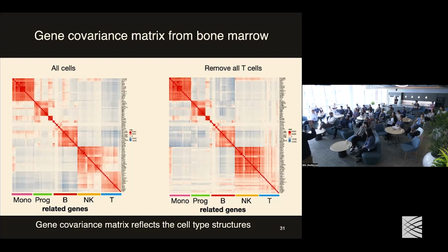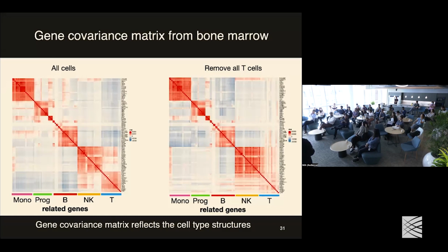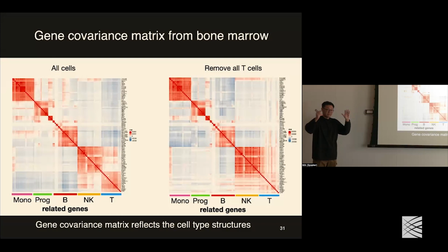They are not independent. You're saying it should also have a unique covariance, not just a unique mean? Yes, because we define those cell types among these samples. If they are unique, they will show some variance. But if it is a pure single population, then we cannot see this covariance.